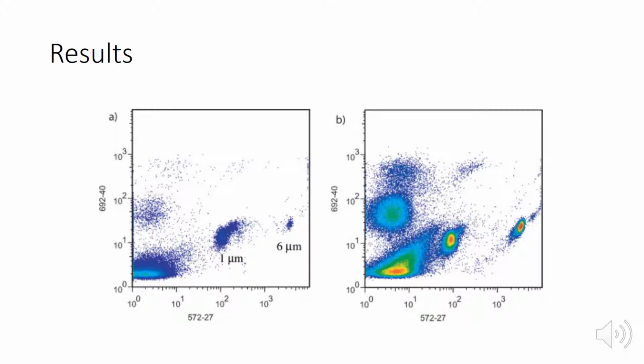The same study mentioned above was replicated, but using raw seawater as a sample this time. Phytoplankton in the seawater can be classified by their expression of chlorophyll and phycoerythrin. The graph on the left represents the data collected from a traditional flow cytometer, and the graph on the right represents the data collected from the virtual core flow cytometer. Again, it was concluded that general characteristics and quantitative measurements of particle concentrations were similar between the two methods of analyses.